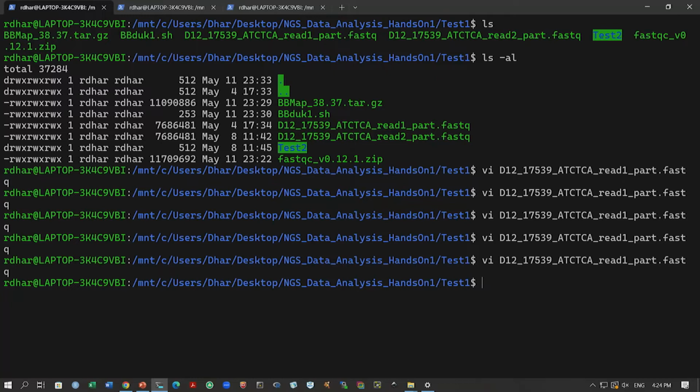So, that gives you a brief overview. Now the next agenda is to look at the quality of these FASTQ files. To do that, we have these steps that we have talked about. The first is setting up FastQC. We will download and set up FastQC, and then run it. We will generate the quality data, and it will give us some idea about the quality of these data sets. So, let us start with that now.